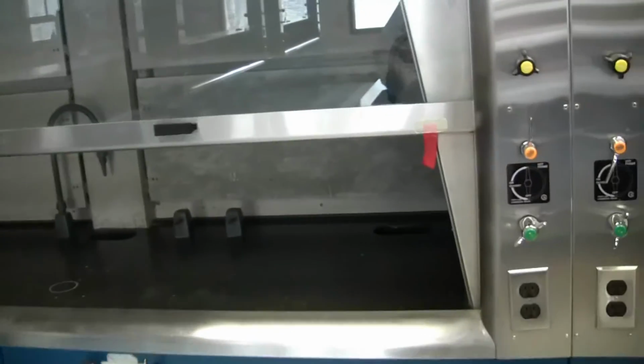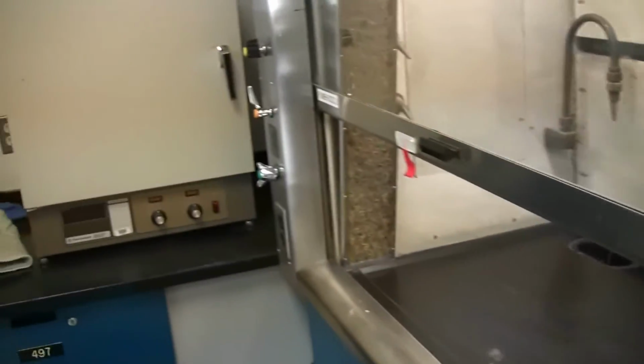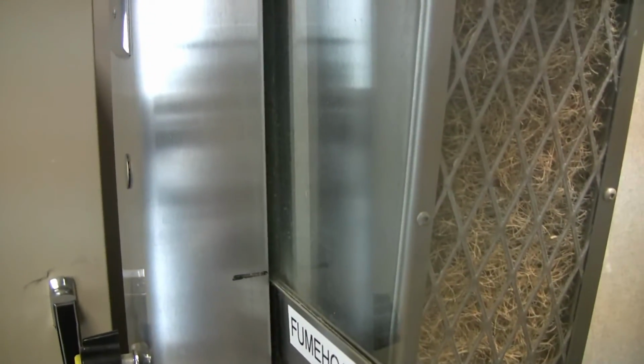When at a fume hood, be sure to first turn it on so the light and ventilation are on as well. On either side of the fume hood there will be this line which indicates that the fume hood glass should not go above this point when performing experiments.